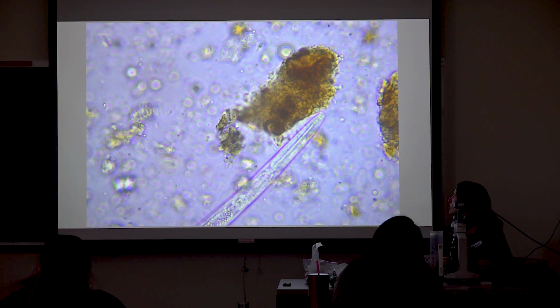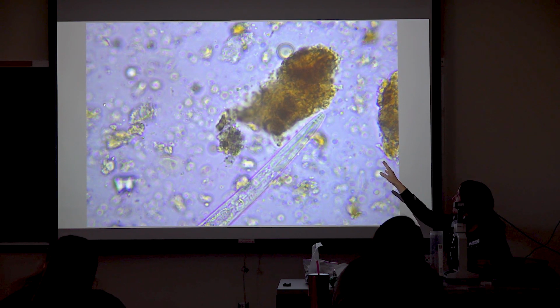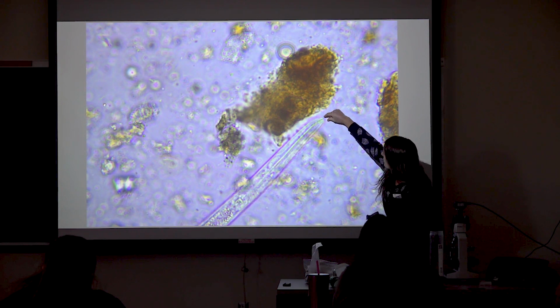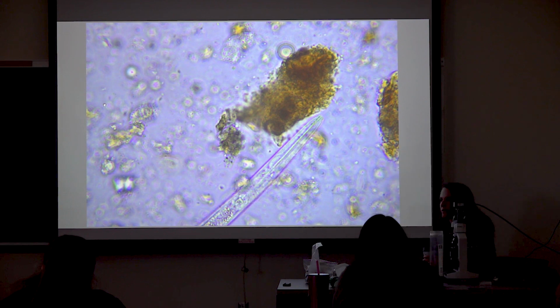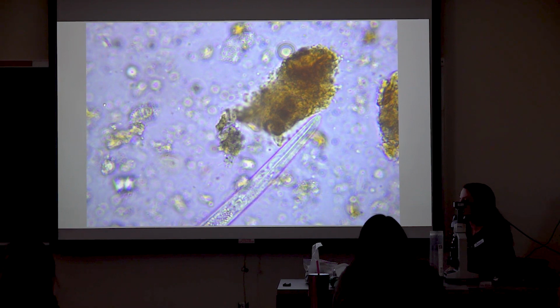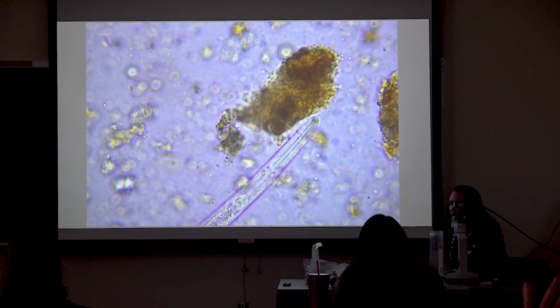And yeah, so the mouth parts are what we look at when we're trying to distinguish different types of nematodes. And it's kind of hard to see. You see that bit of a flange on the end of its head, those big fabulous lips that it's got? Usually that is a good indication that it is a bacterial feeding nematode. I've seen some that have structures that it's a little hard to believe are lips, but they're pretty fabulous. And you're also going to see this big wide opening for the mouth. That's also an indication that it's a bacterial feeder. So they're just sucking in all the bacteria they can as fast as they can. Nematodes are going to be one of the primary cyclers of nitrogen in your soil. That huge organism, they can eat thousands and thousands of bacteria every single day.